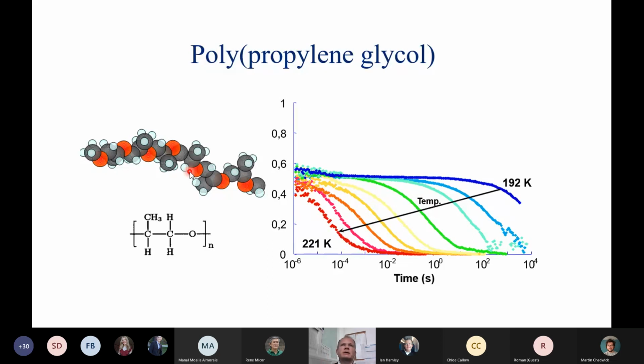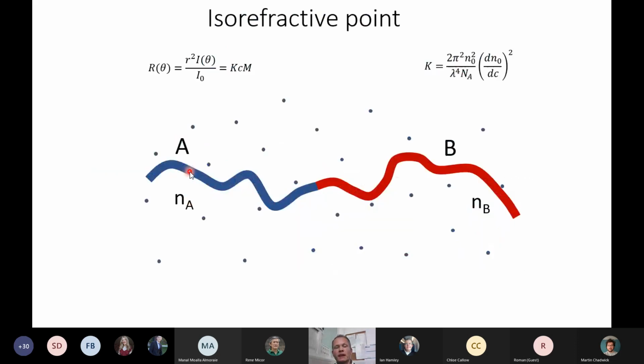But I guess if you are working with a solution of proteins, you shouldn't be concerned about this very much. But again, there are no particles here, but we do see some kind of changes of the correlation function with time. And if we calculate its distribution, you will see some peaks, but these peaks are not real. It just shows that we have some kind of thermal motion in this bulk material.